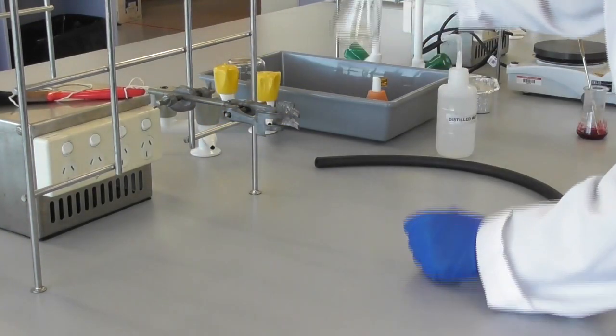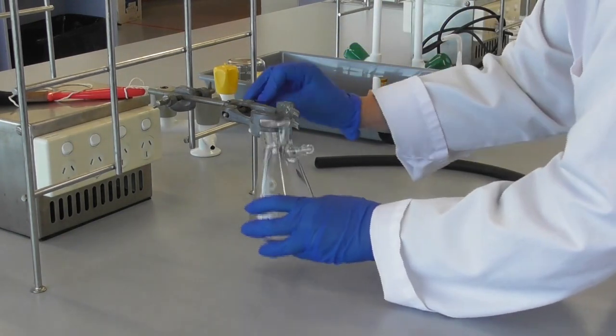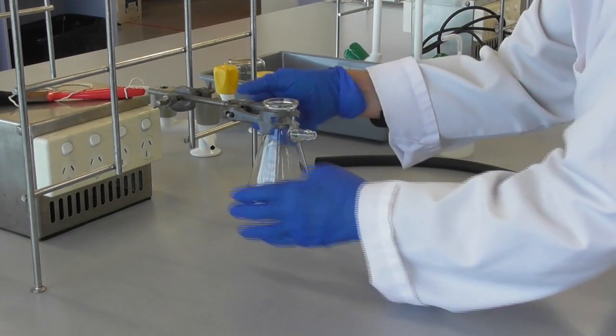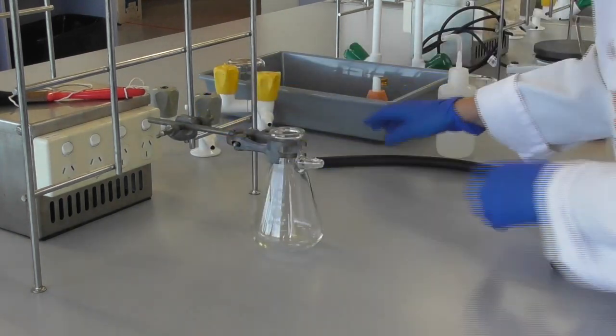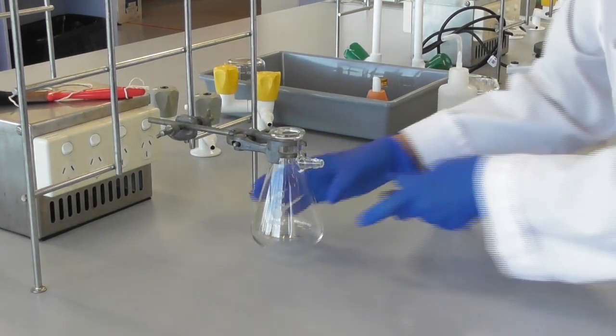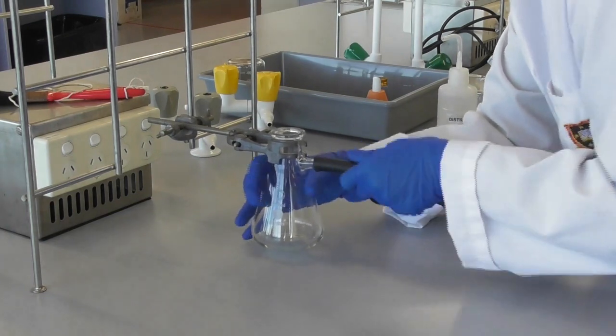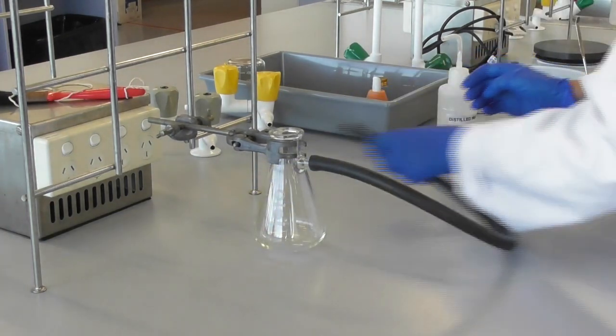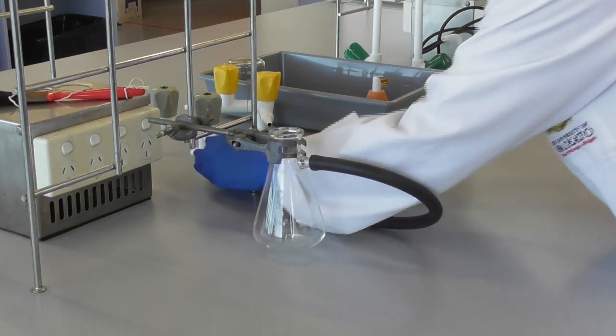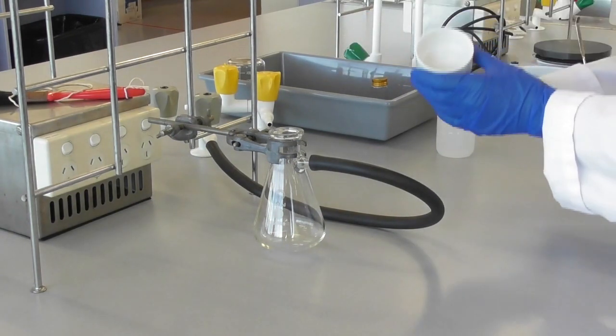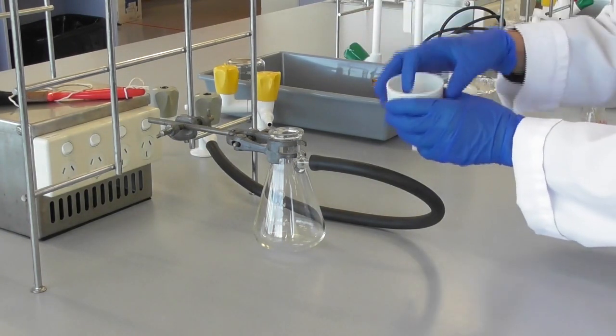While this is happening we can set up the filtration. Clamp a vacuum flask, attach the vacuum hose to the flask and to the vacuum outlet. We add a Buchner funnel with filter paper on top of the vacuum flask.